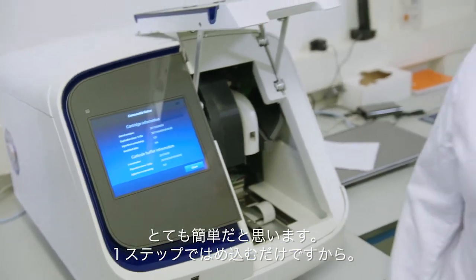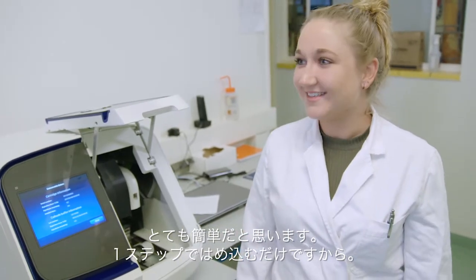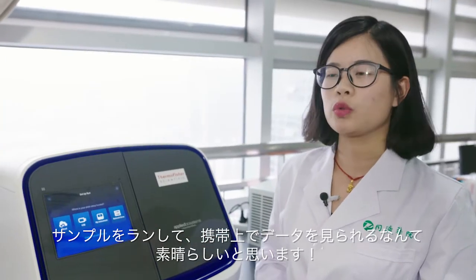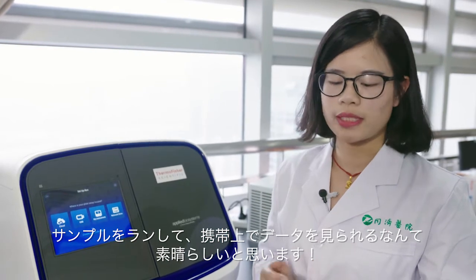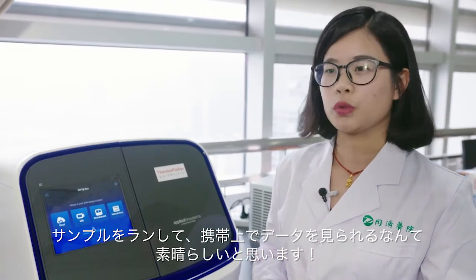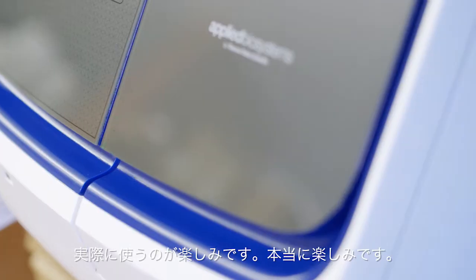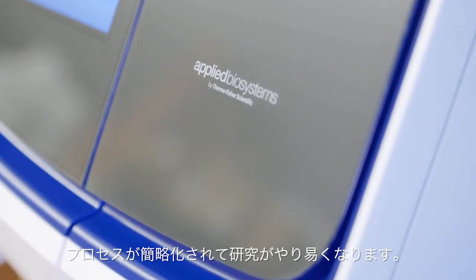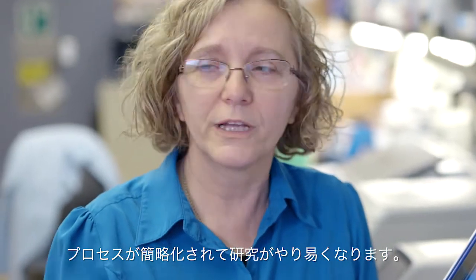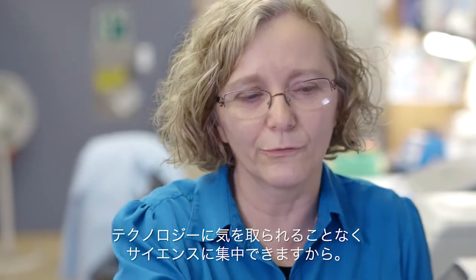I think it's really easy. It's only one step and it's just clicking it in. I am looking forward to working with it — very much so. We make it easy for us because we can streamline the process and then focus on the science instead of the technology.